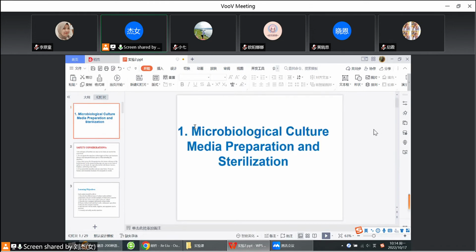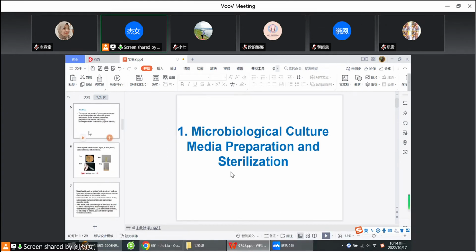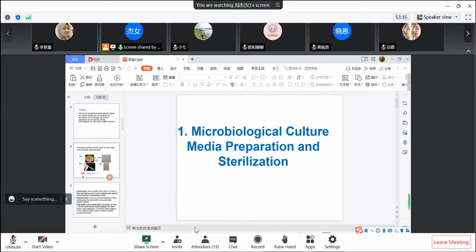The first part is about the microbiological culture medium: how to prepare medium to culture the bacteria and how to do the sterilization of the medium.